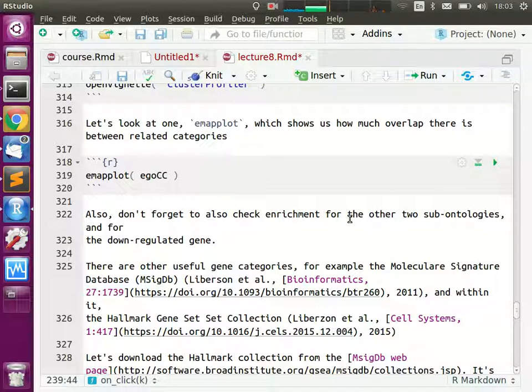What we have to do next time is, you might all know this concept of gene set enrichment or GO enrichment, where you have your long list of by now 1300 genes. We want to know what they have in common, and we will find next time that the thing they all have in common is that they are known to be related to the epithelial to mesenchymal transition, and to the extracellular matrix, so that we have especially many secreted proteins.